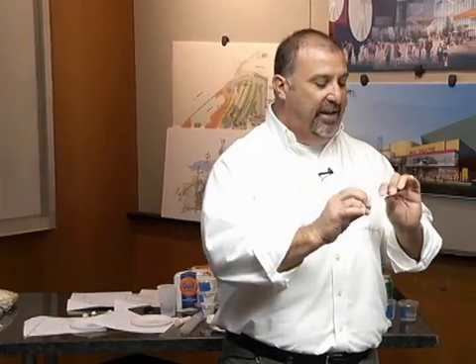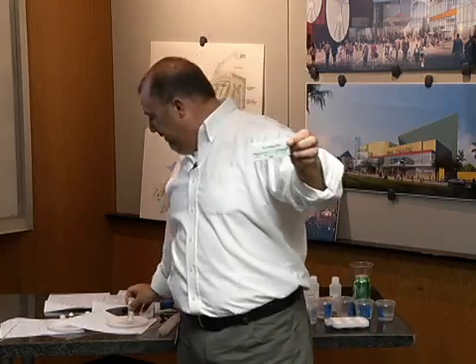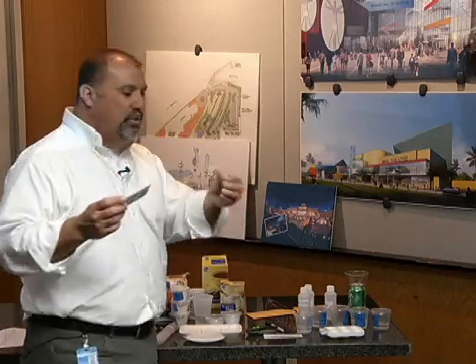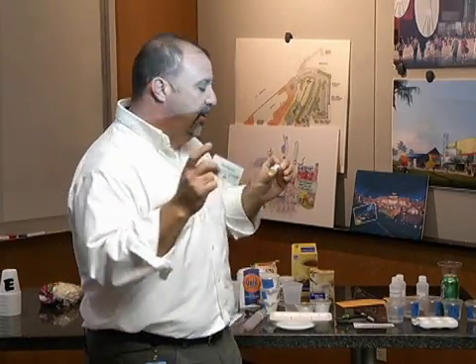Okay, so what were some of the numbers that you found? Okay, water, you had about a 6.5, 7. Some people had a 7.5, 8, so kind of in that area. You can use the chart that's on your little tablet here, or I printed this off. This is just another pH chart. Depending on your color printer, though, these colors can vary a little bit. So if you can, use this one on here, because that'll most correlate to what's inside the tube with the paper that's there.